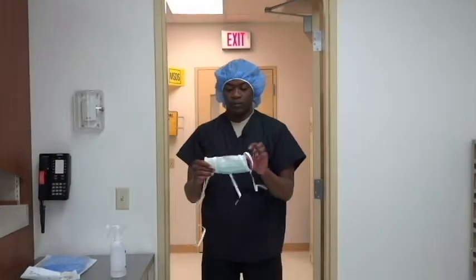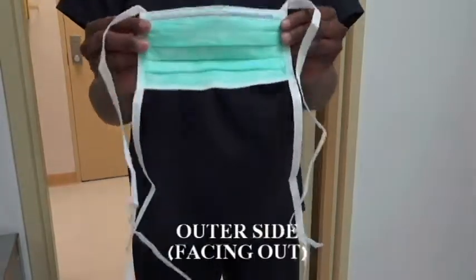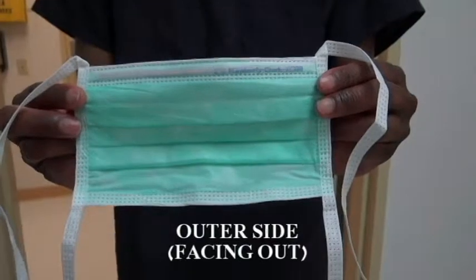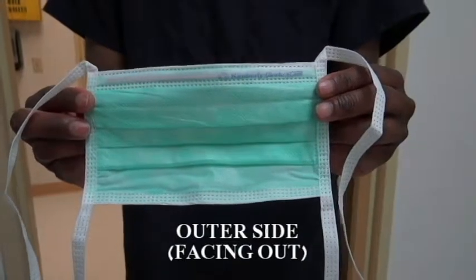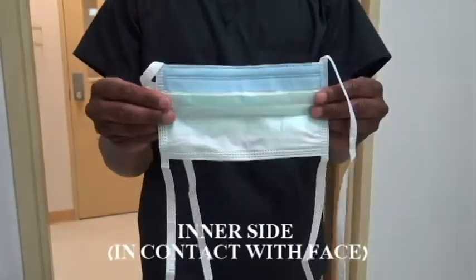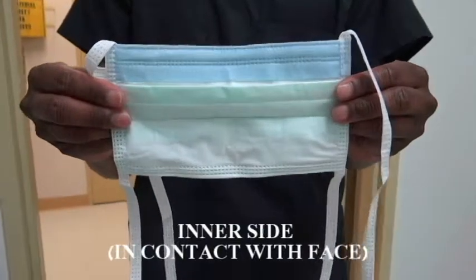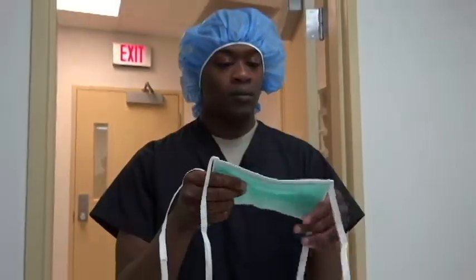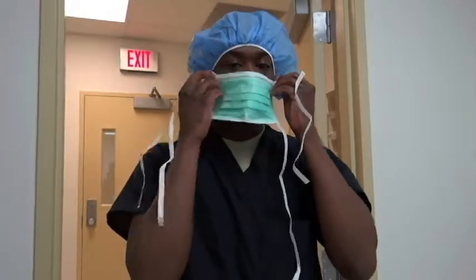Don face mask with flexible wire over the bridge of your nose. The colored or outside of the mask must be facing out and the soft cushioned inner side is the contact with your face. Place top laces above your ears and tie around towards the back of your head and above the bun if applicable.